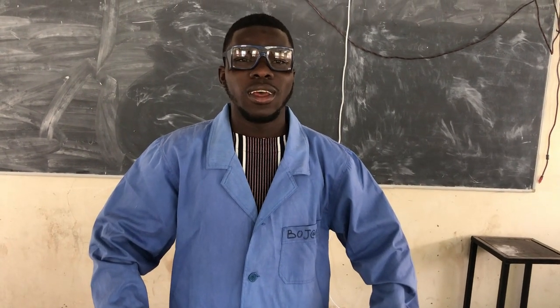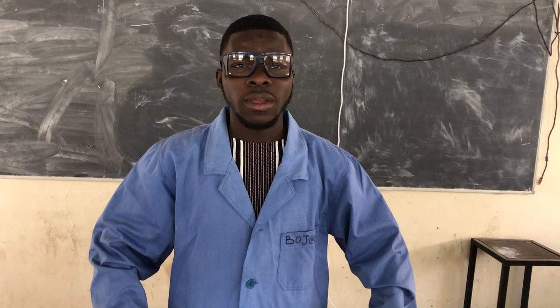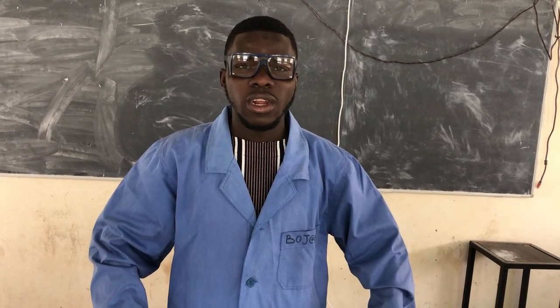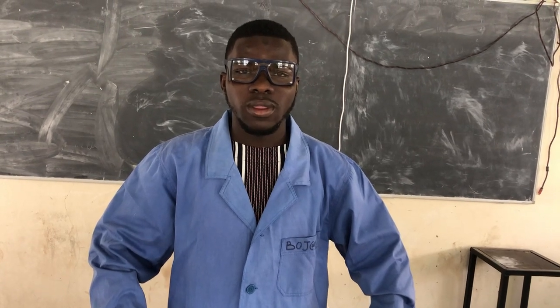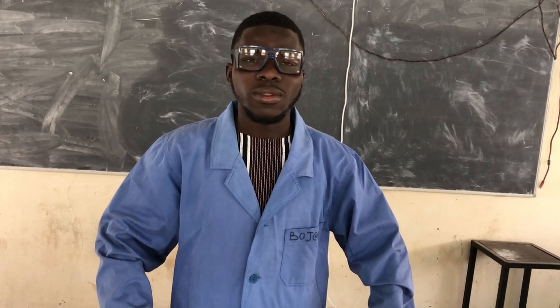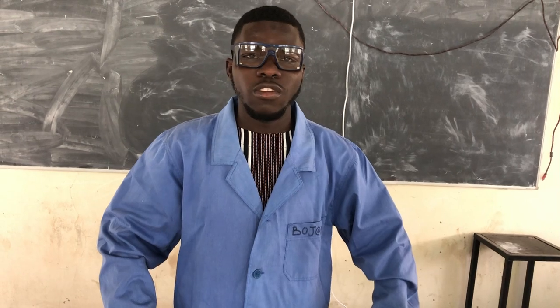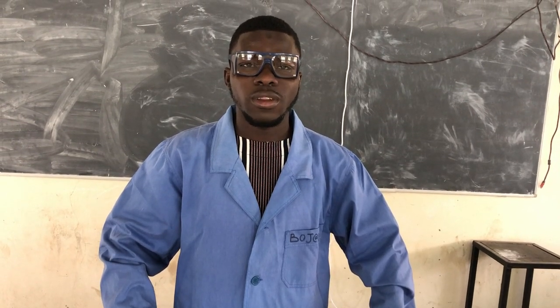Welcome back. In this lab, I'm going to show you how to prepare saturated solution, unsaturated solution, and supersaturated solution. Before we go further, you have to know what is solubility. Solubility is the amount of solute that dissolves in 1 dm³ of a solvent.